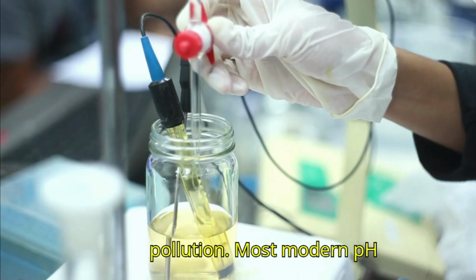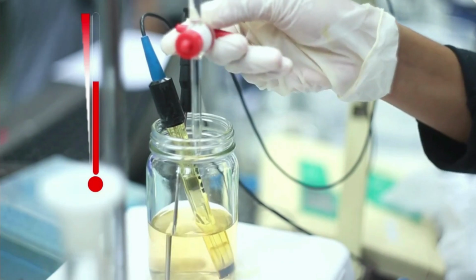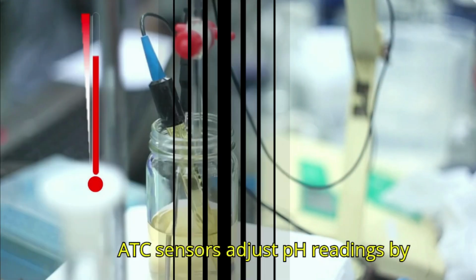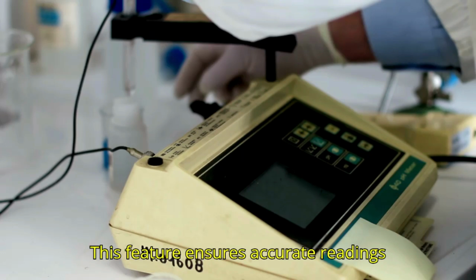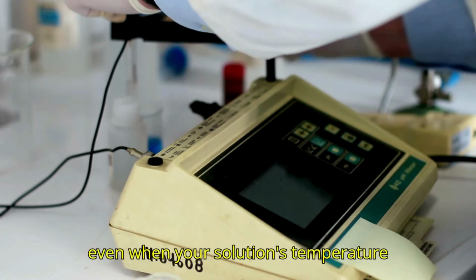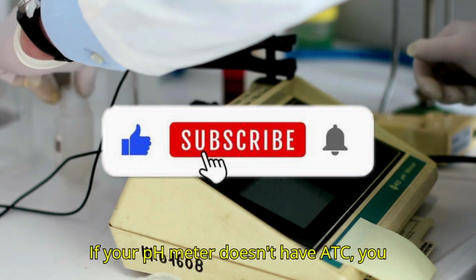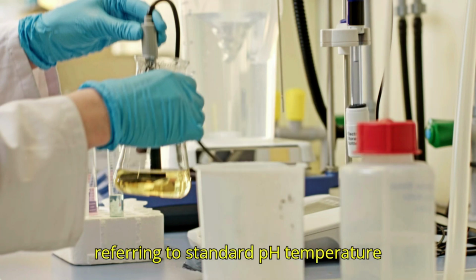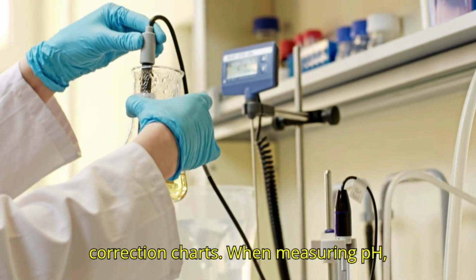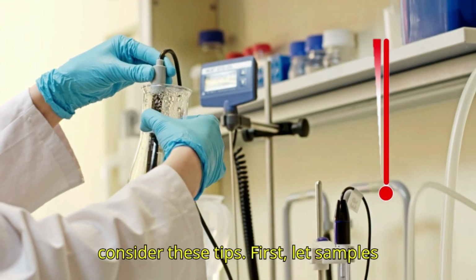Most modern pH meters come with an automatic temperature compensation (ATC) feature. ATC sensors adjust pH readings by factoring in the solution's temperature. This feature ensures accurate readings even when your solution's temperature deviates from standard room conditions. If your pH meter doesn't have ATC, you can still manually correct readings by referring to standard pH temperature correction charts. When measuring pH, consider these tips.